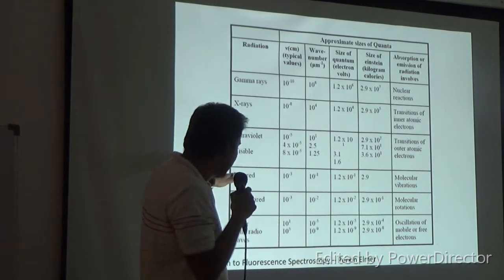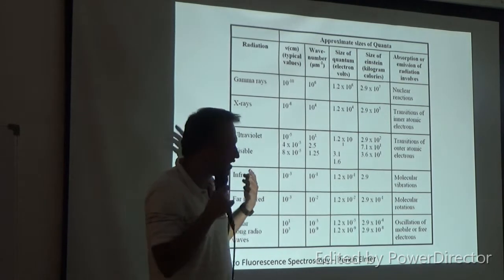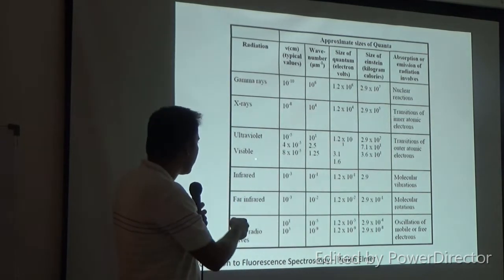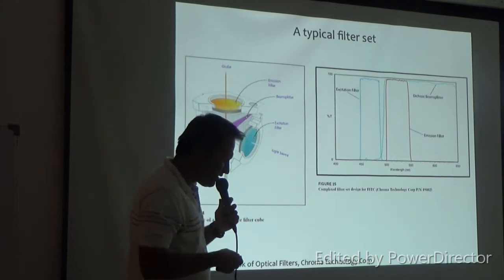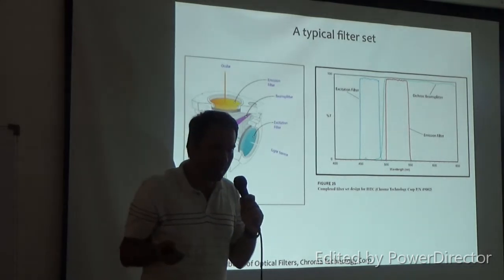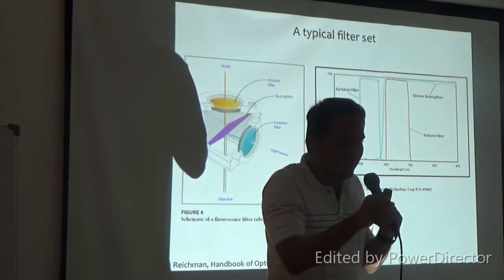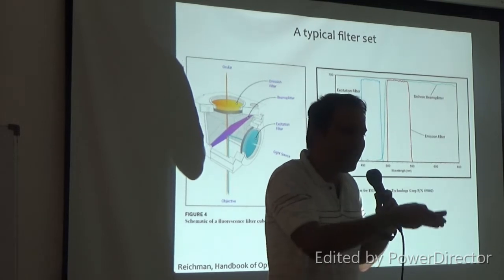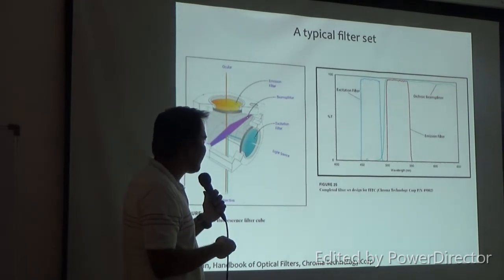As you go longer in wavelength, this also comes down quite a bit. In radio waves, there will be very, very little energy. But this is what we are concerning ourselves with now. And this is what we said, right? We can have a white light source, like my phone's LED, maybe a little better LEDs than that. Then I can put a blue glass in front of that, I will get only blue light, and can shine it on my fluorescent solution, it will emit green, which I can detect through my emission filter. So that's your basic light microscope, right?